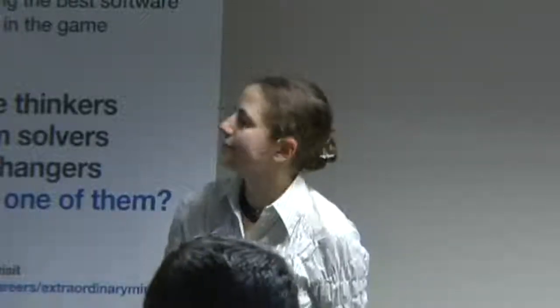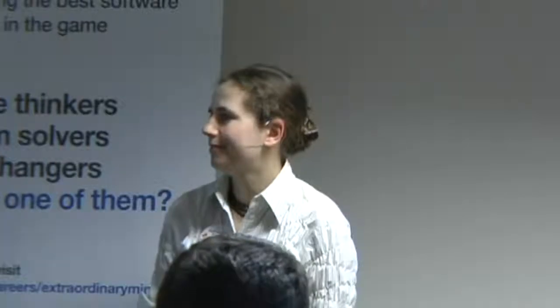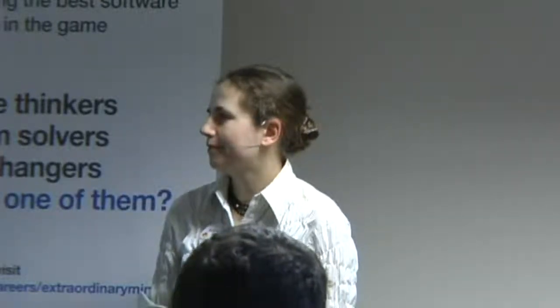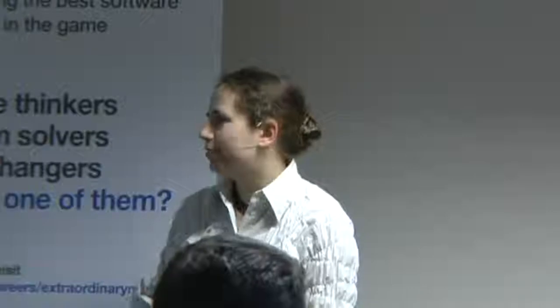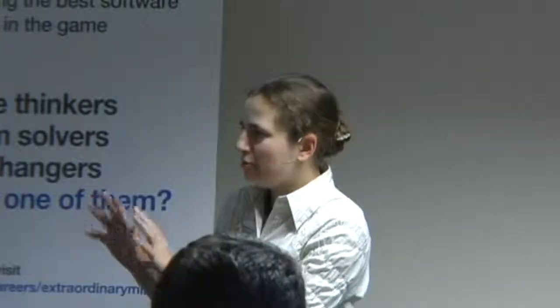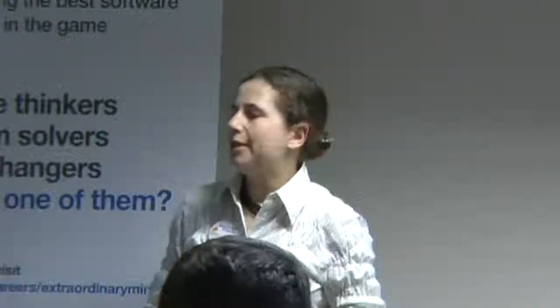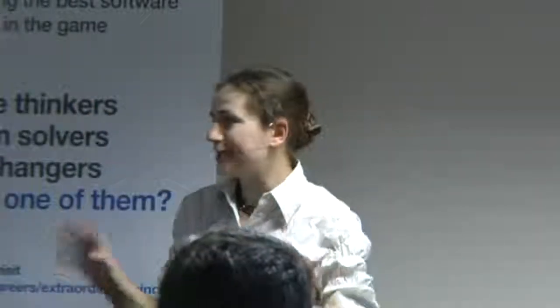You're talking about expanding this to more researchers. Well, I'm not sure yet, but theoretically. What you've got here is a conversion from one specific equipment format to one specific website format. Are you planning on expanding this to more types of equipment? Well, it remains to be seen what demand there is and who else is interested in using it. I was mostly talking about extending it to other researchers in the same lab who possibly use the same machine. The CDD is relatively standard, a relatively popular portal that lots of people use, so the output side is potentially useful to lots of people. On the input side, there's definitely the option of extending this to different layouts of assays, possibly even entirely different plate readers with different widths and lengths. So it's possible, it hasn't been done yet, but it could happen.